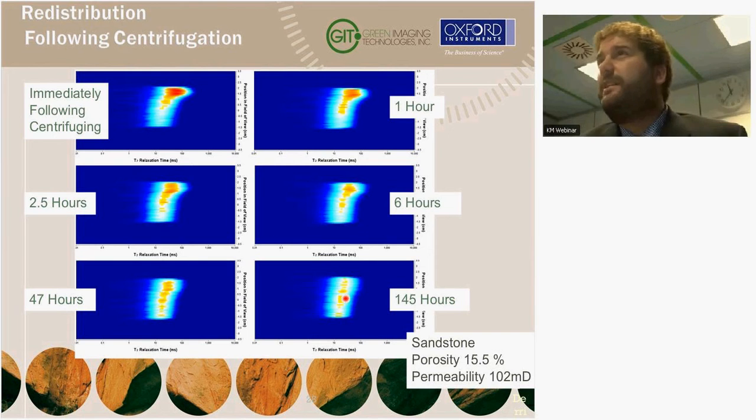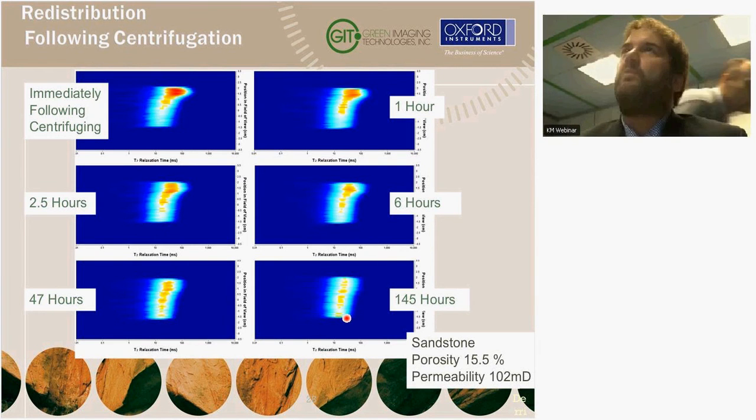So here it's at equilibrium. I don't know whether this will ever equal out. I haven't done the measurement after months, but you can see we can get information. It's applicable to many different types of flow studies, EOR studies, wettability alteration, in which to do this measurement.